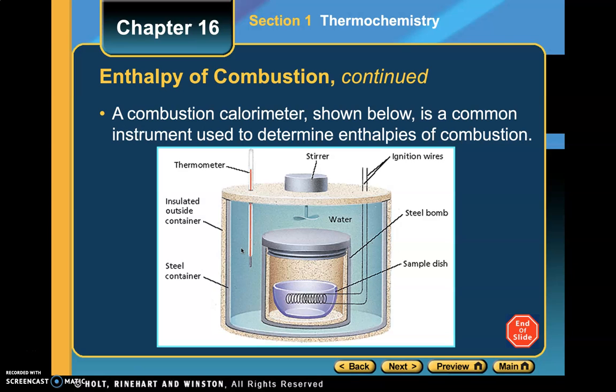So that's all we're trying to show you here, is what a bomb calorimeter would look like. Like I said, if we were in class, we would build one of these and use one of these in class. Sadly, we're not, so we'll have to just do this virtually.